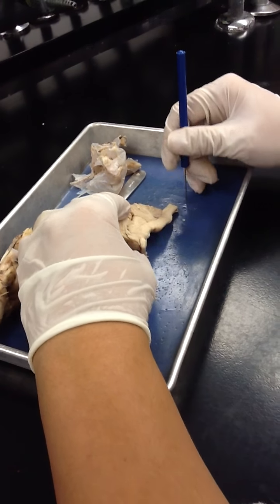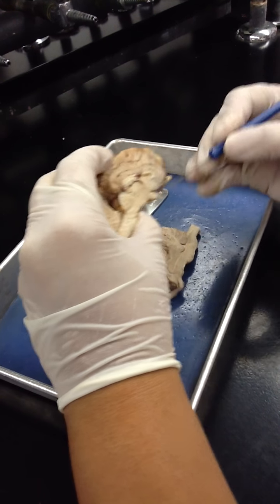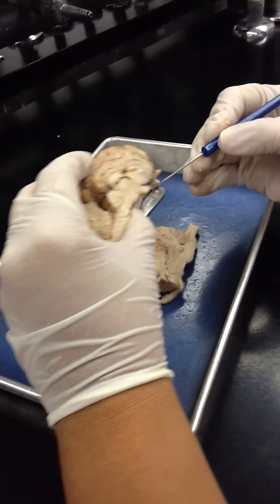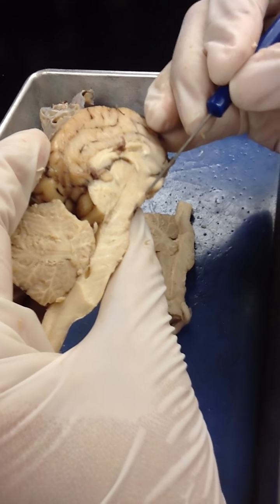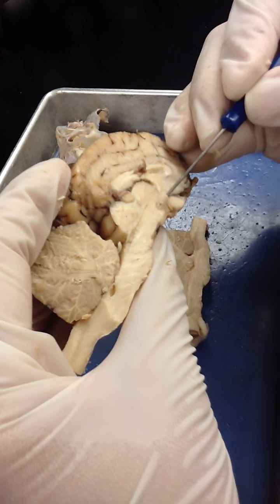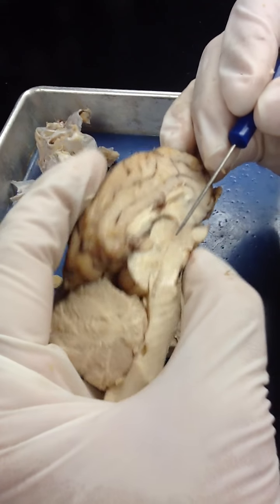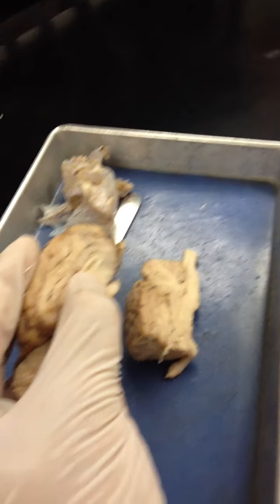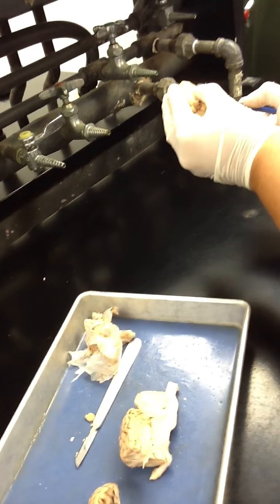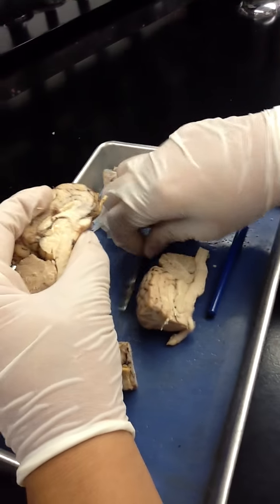Well, the hypothalamus is wherever your pituitary gland is. The pituitary gland is right out of here, so your hypothalamus would be right in this area. Do you see right there that little H shape? That's your hypothalamus. This is your third ventricle right there, because you see how there's a space. Even in humans, the hypothalamus has that shape. Notice that it looks like this, like that, and like that. That's your hypothalamus, and in humans it has exactly the same shape.